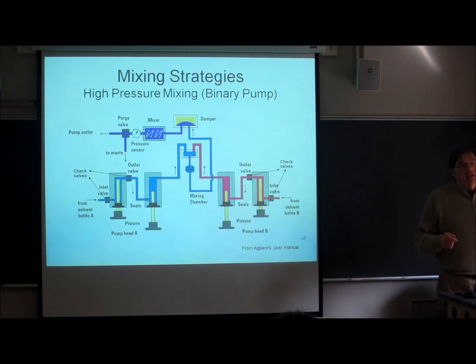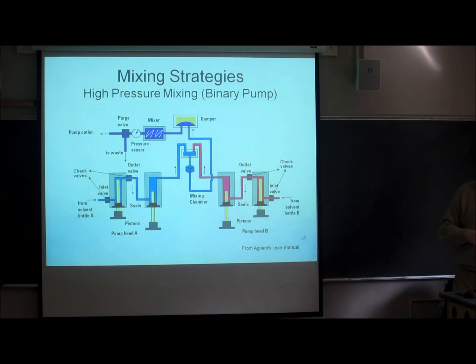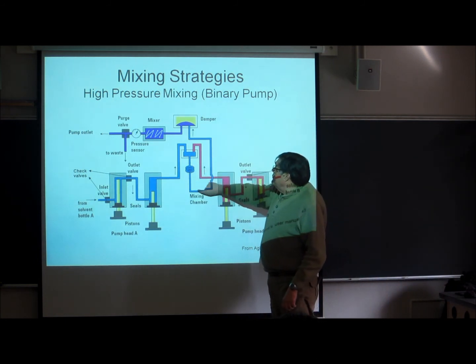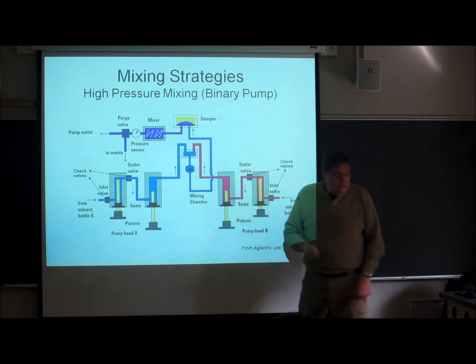There's an alternative. You can sparge, it's called, the solvents with helium. Okay? And helium is not very soluble in solvents of any kind. And since it's not, when you have a lot of it in the solvent, it will drive out the other gases, and you'll be left with just a small amount of helium, and you won't have the trouble with the bends. Okay? So this shows about everything except mixing. This is a mixing chamber, and then a final mixer up in here. So there's a mixer and a damper and whatnot. All right, so this is a more complicated instrument.